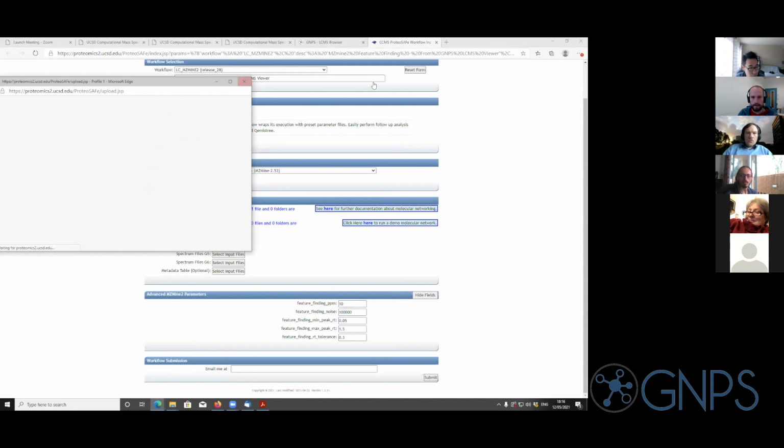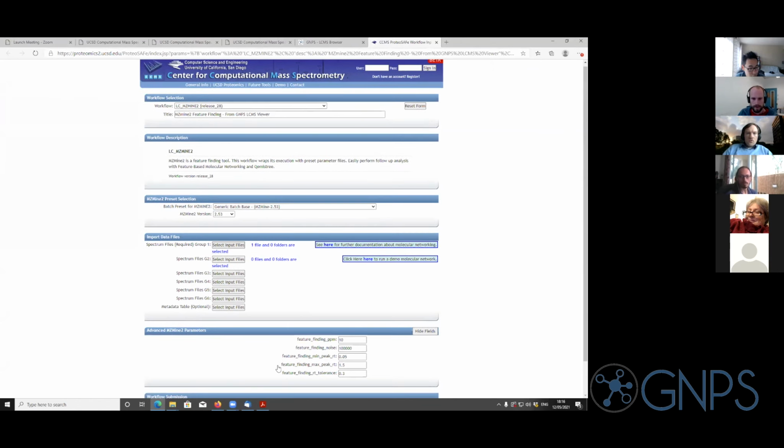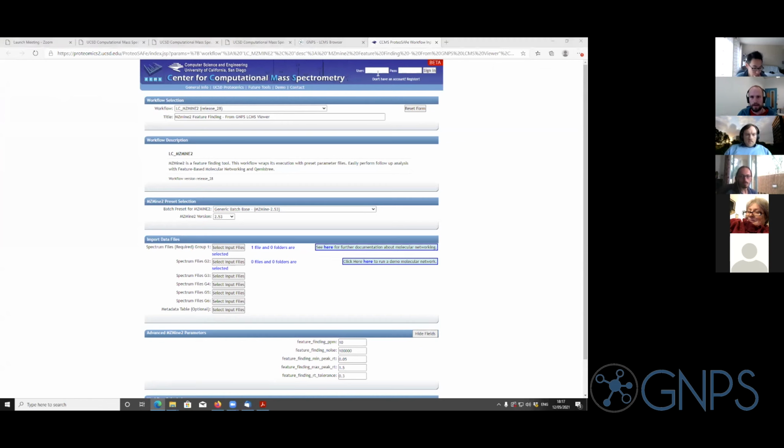If you submit this, you have to provide your email, and you also have to be logged in. You submit this, and then you will get an output. Just let me log in really quick.